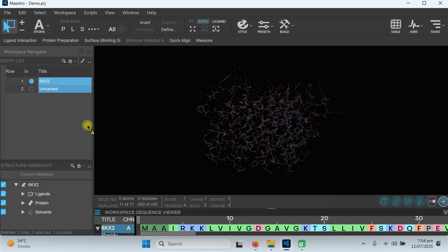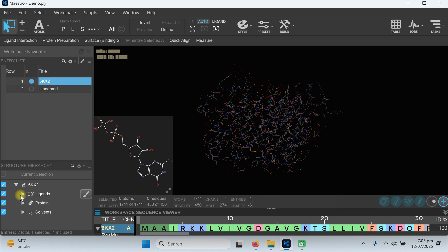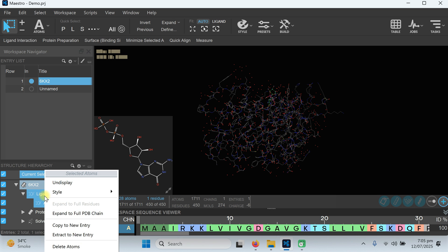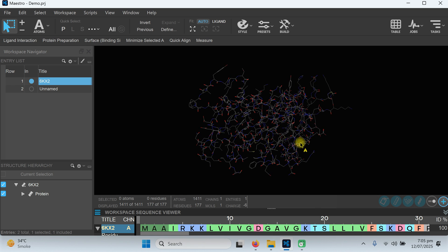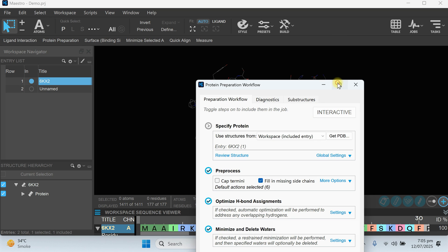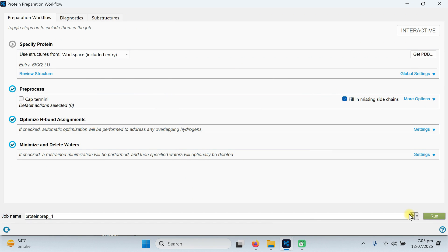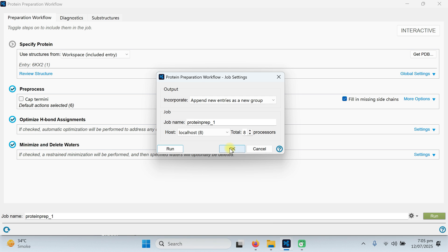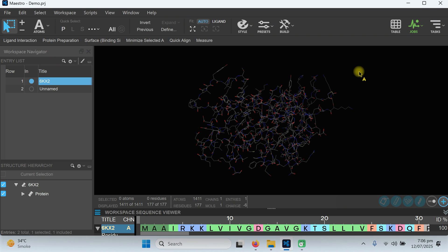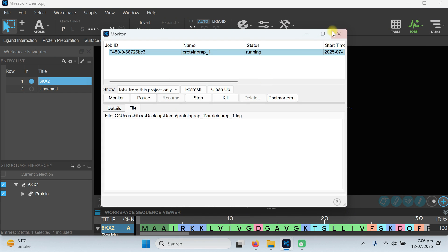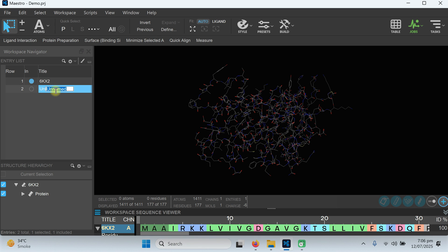The structures are imported. This is our protein, which contains a bound ligand — we need to remove this bound ligand. Delete those atoms, and also delete the solvent water molecules. Now we have a clean protein. Go to the Protein Preparation Wizard using the default settings, go to the Jobs tab, choose the maximum number of processors to finish the job quickly, and click Run. Our job has started.